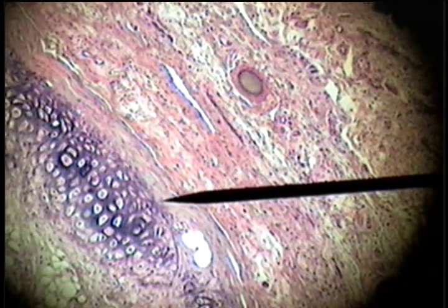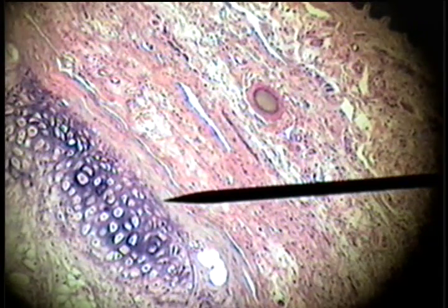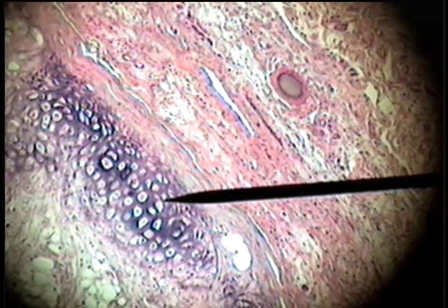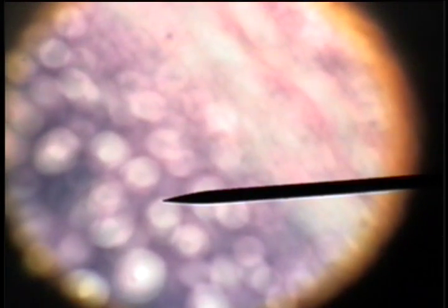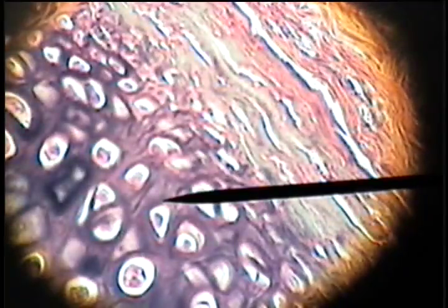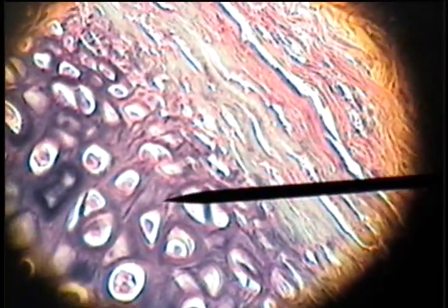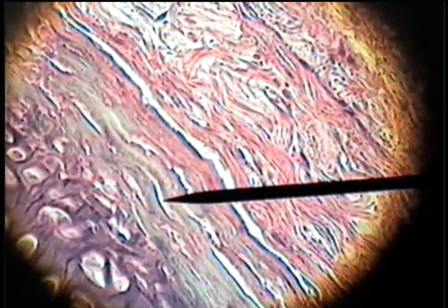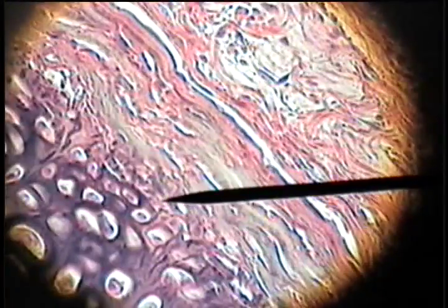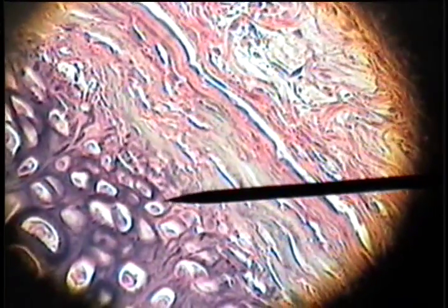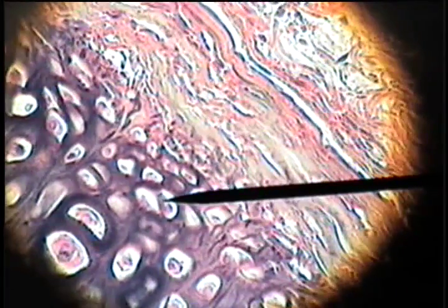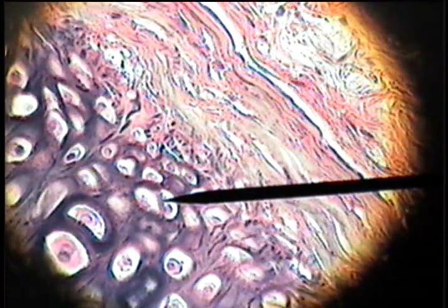Here is the perichondrium again with the chondroblasts and the adult chondrocytes. If we examine it on higher power, here is the fibrous perichondrium, here are the smaller chondroblasts on the edge, and here are the adult chondrocytes.